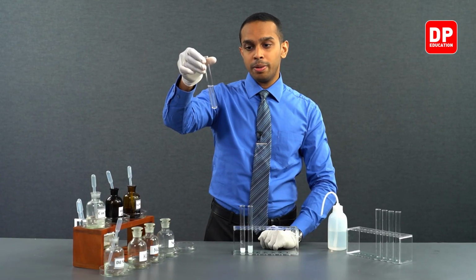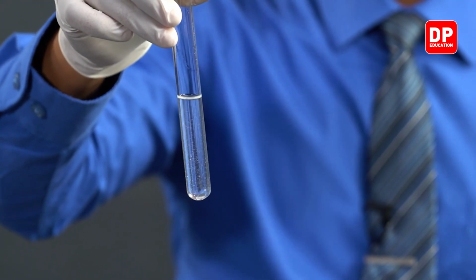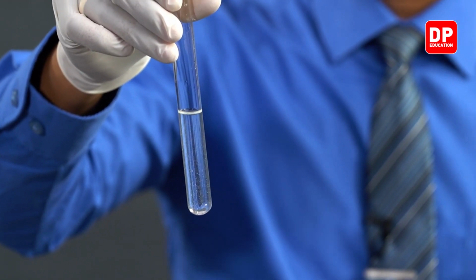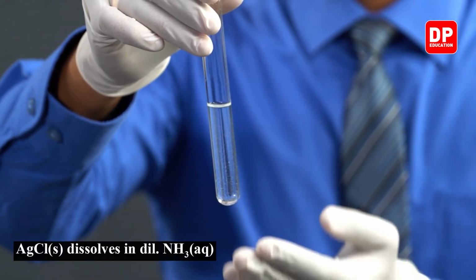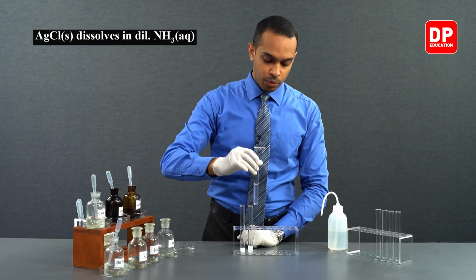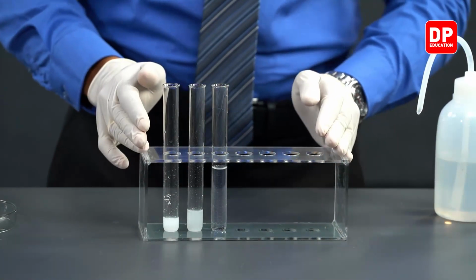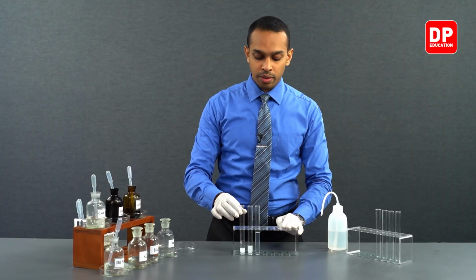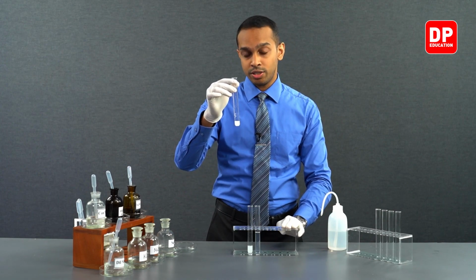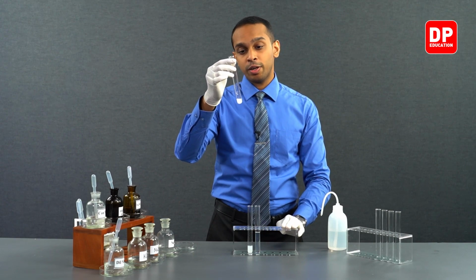Now you'll be able to see an almost clear solution because the dilute ammonia was able to dissolve the silver chloride solid that was present in this test tube. So with this, now you can see a nice comparison where we started with mixing sodium chloride and silver nitrate, and we produced a precipitate, silver chloride.